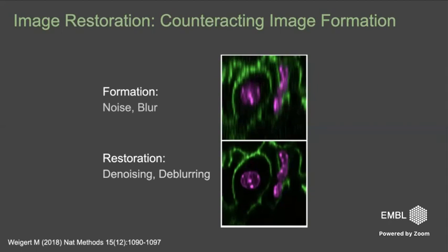So while this is very good, right, and it looks beautiful, it's in general very tricky to convince yourself that the lower image is really the reality. So there I also don't have an easy answer. I just want to point out that you should always stay skeptical if you use such methods.